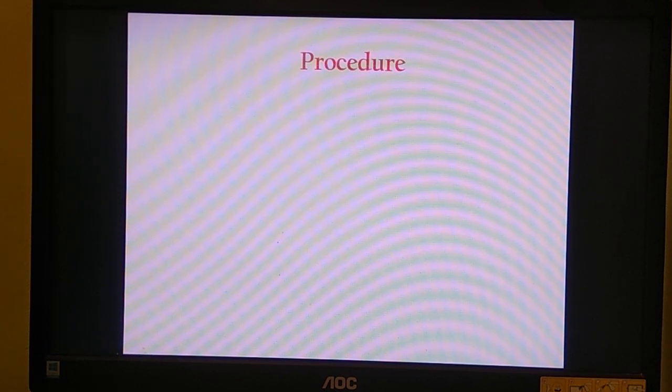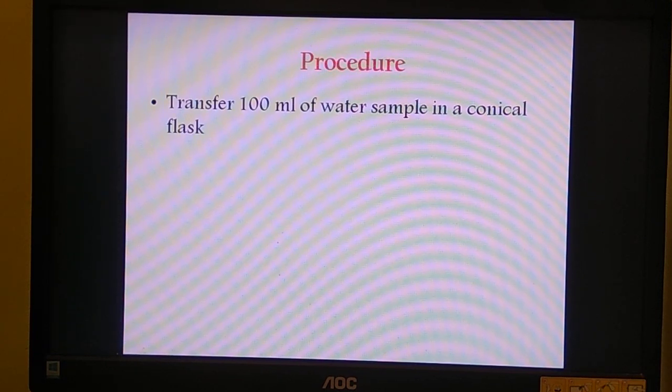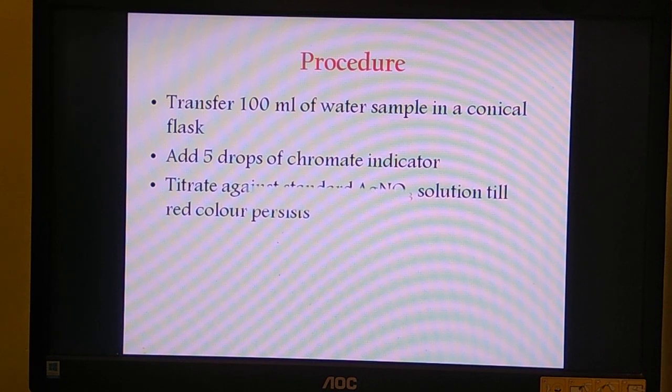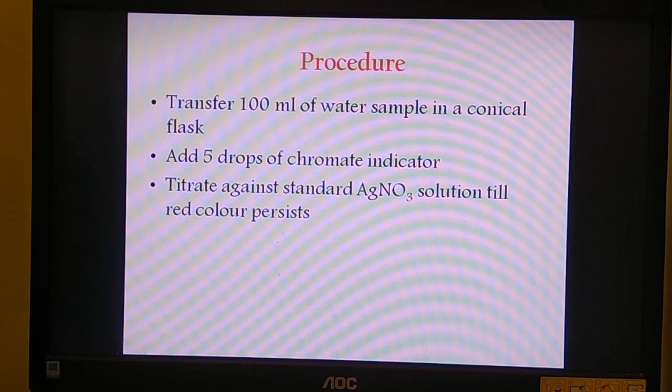Moving to the procedure. We need to transfer 100 ml of the water sample or test sample in a conical flask. To this we have to add about 5 to 8 drops of chromate indicator, which is the yellow colored solution, potassium chromate. Then we should start titrating it against the standard AgNO3 solution taken in the burette until the red color persists. This formation of red color, permanent red color, is an indication of the end point of titration.